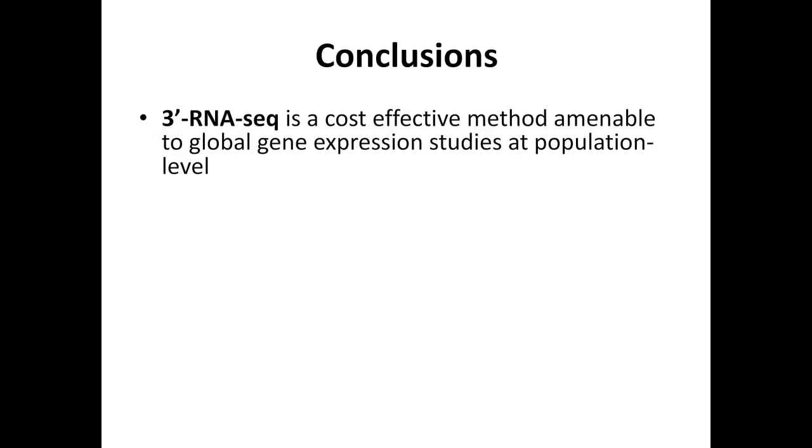At the end, I would like to give a few conclusions. As you see, we haven't finished all the way, but I feel that we are confident to make some conclusions from this study. First of all, it's going to be a big cost saving. If the goal is just to quantify gene expression, we can save cost because this method requires a very low amount of sequencing.